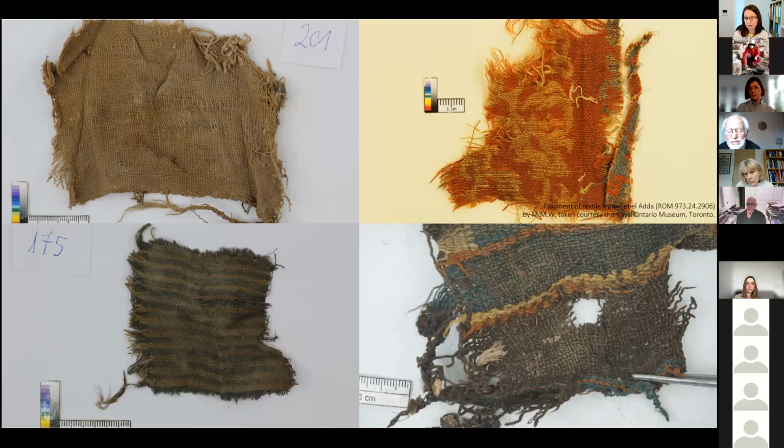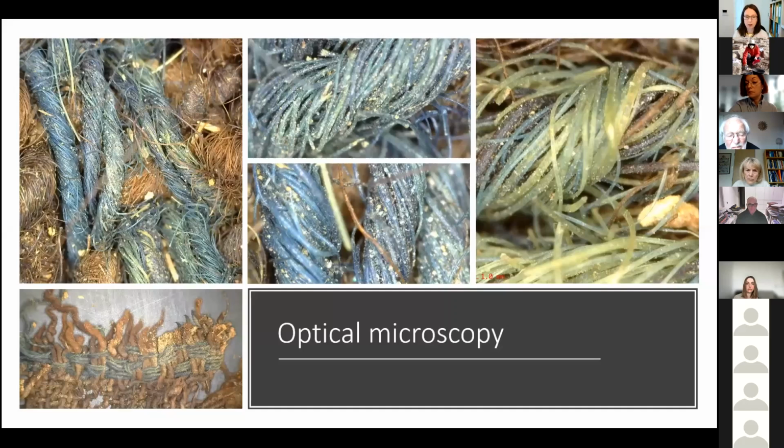You can see in these images that even with the naked eye, you can appreciate different widths of the threads. These are things you can really assess with no specific material. But you can also, which is something really helpful in the field, use optical microscopy.